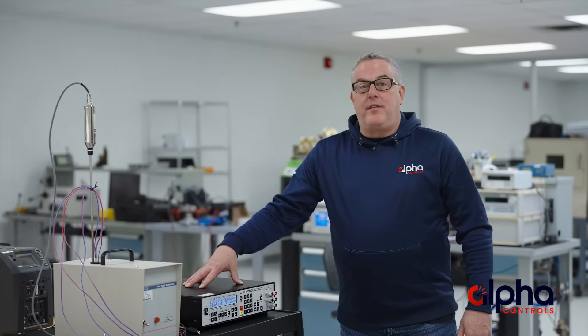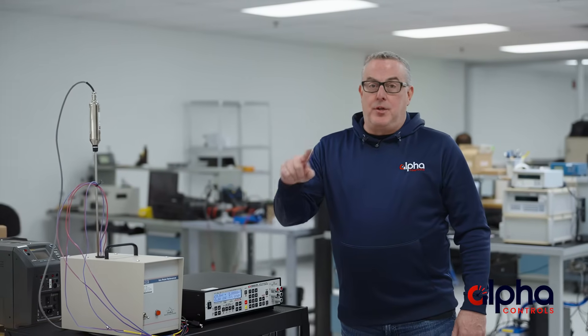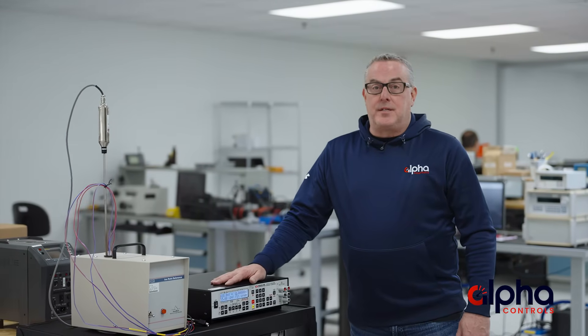We're also outfitted with a mobile AVS bench, which allows us to come to you and calibrate your AVSs at your facility. As you can see, Alpha's calibration capabilities are just as flexible as the AVS itself.